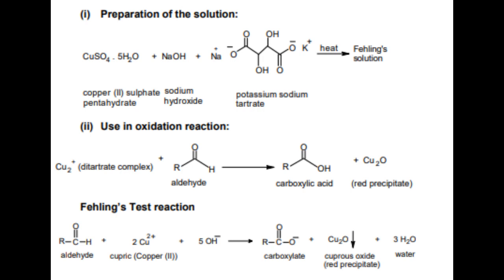4. Fehling's test. Aldehydes reduce Cu2+ to Cu+ and form a red precipitate of Cu2O, while the aldehyde gets oxidized to the carboxylic acid. Fehling's solution. I. Preparation of the solution. Look at the screen. II. Use in oxidation reaction. Procedure.